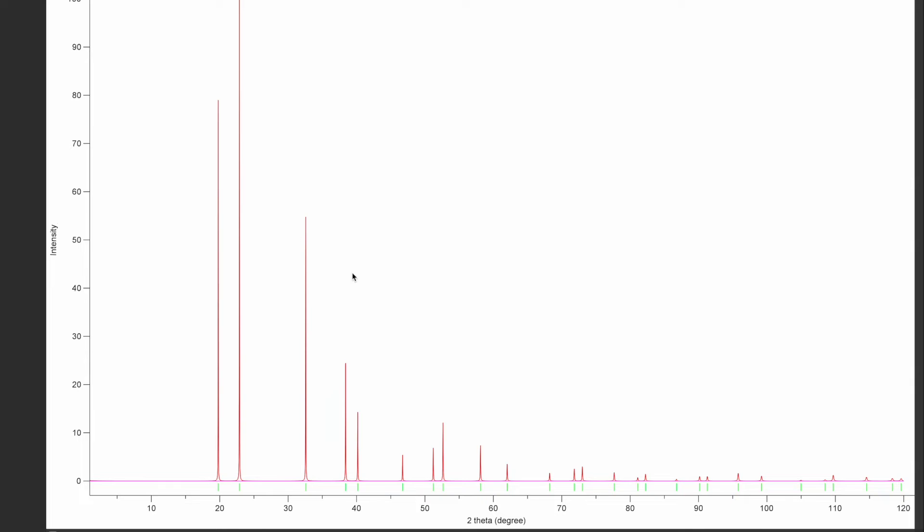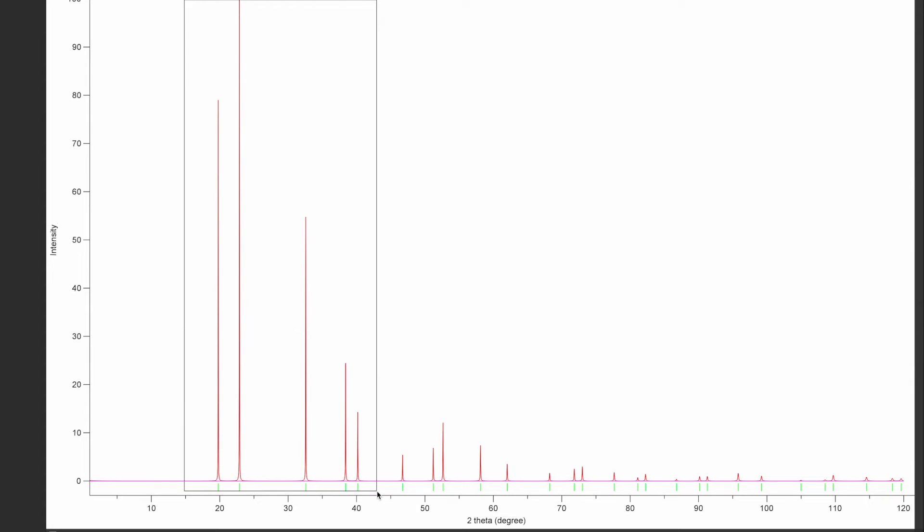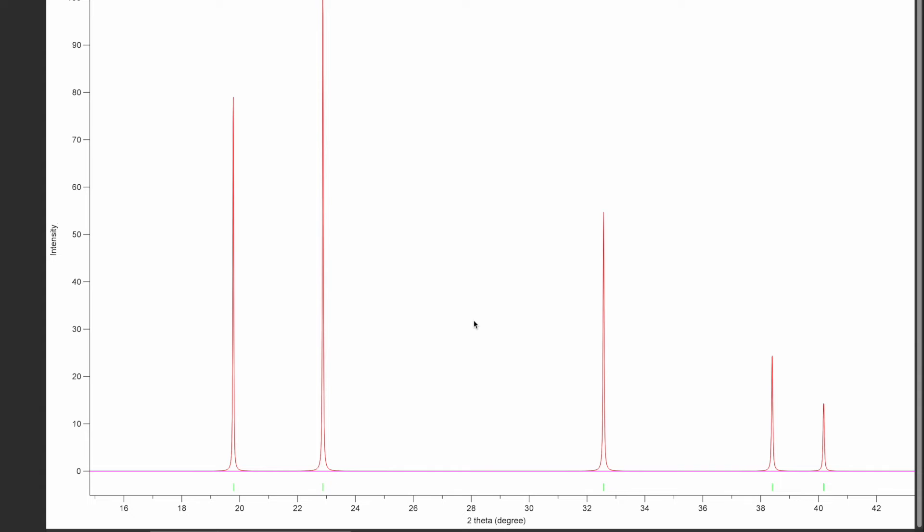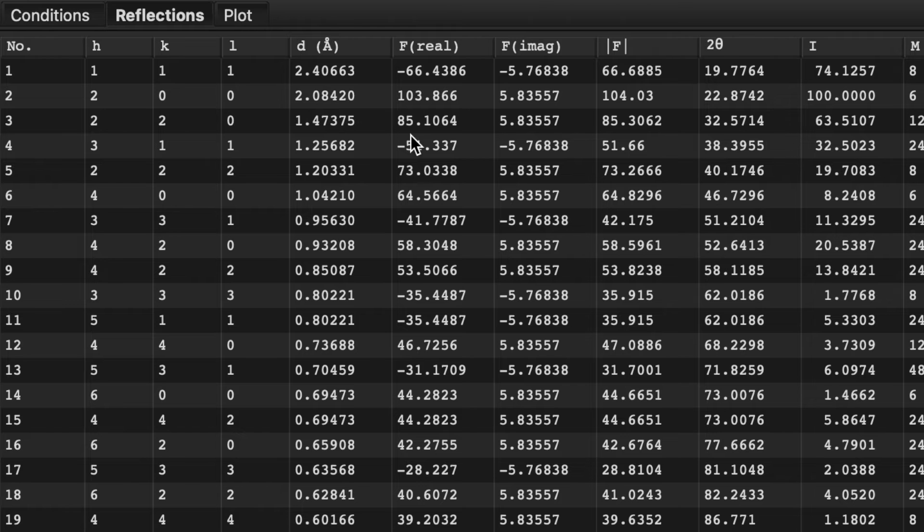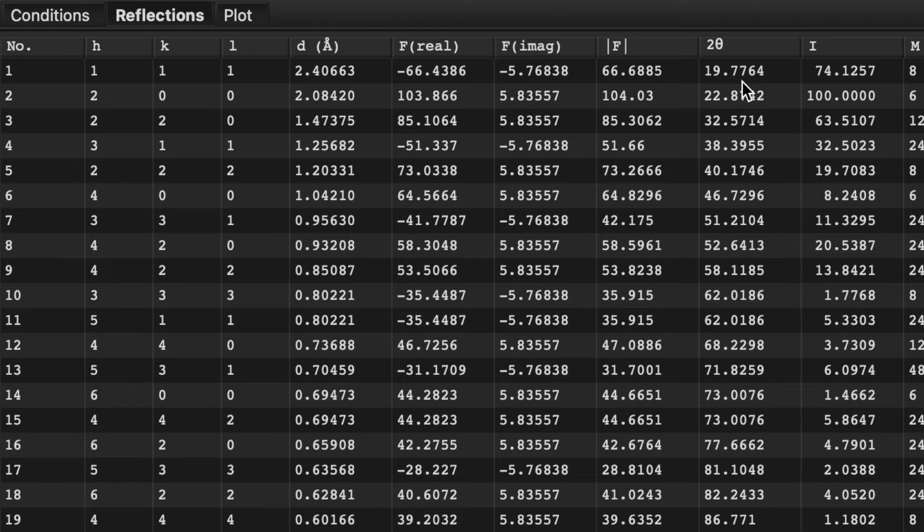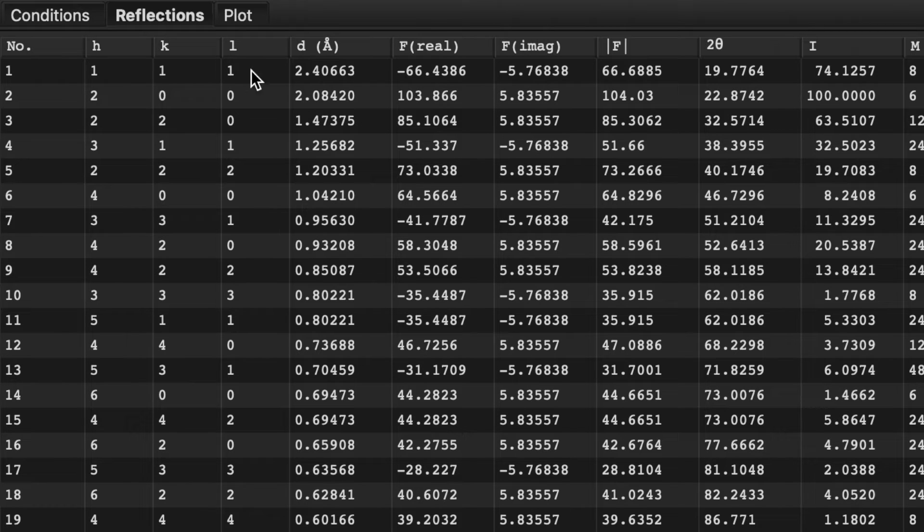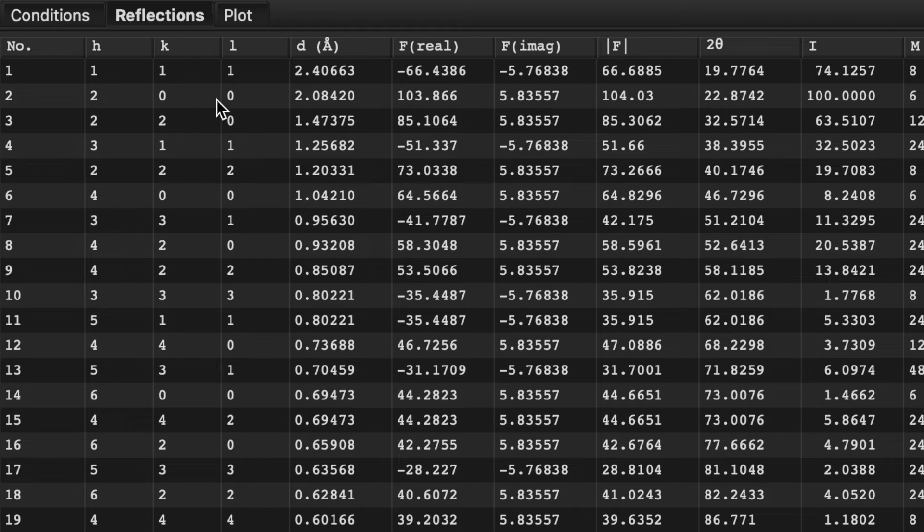Go to the plot. This is the XRD diffractogram which is similar to what we have in our hand. Go to the reflection list and here you will see the values for 2 theta which is 19.776 for the 111 plane and then 22.874 for 200.